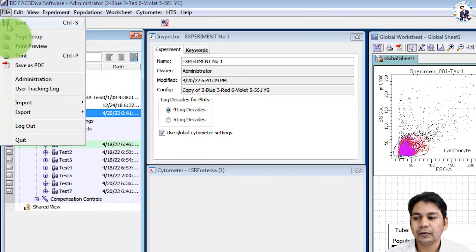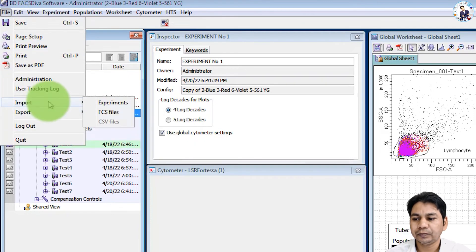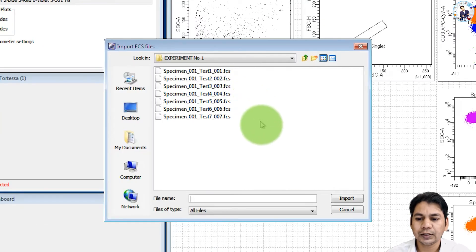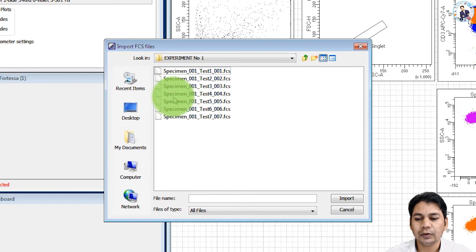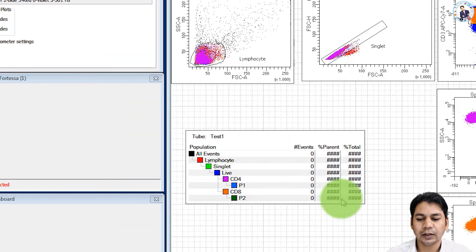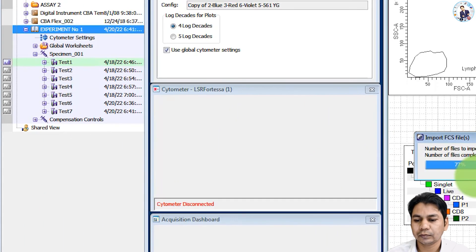click here on file, import FCS file, and select all your files that you want to import in your experiment and click here on import.